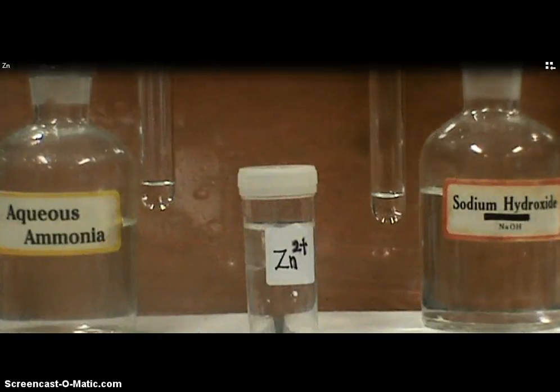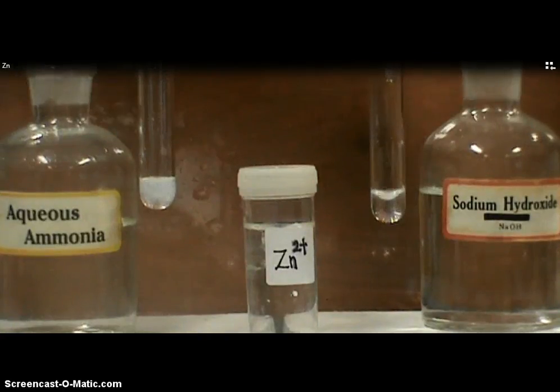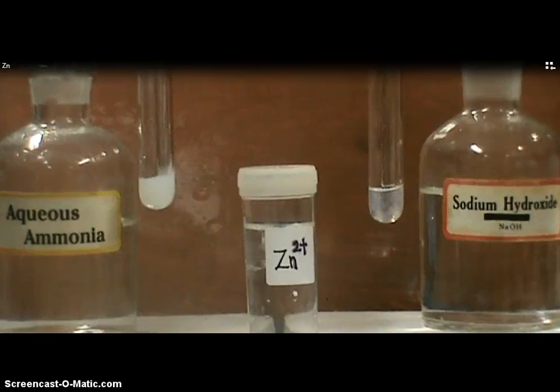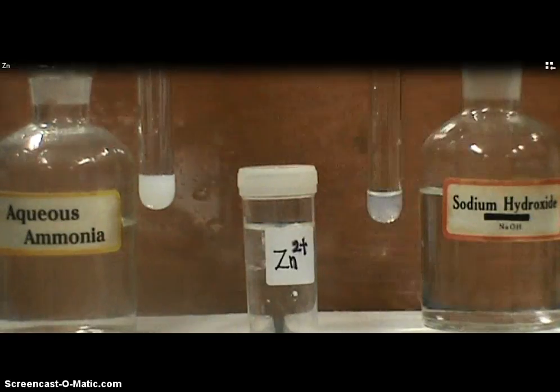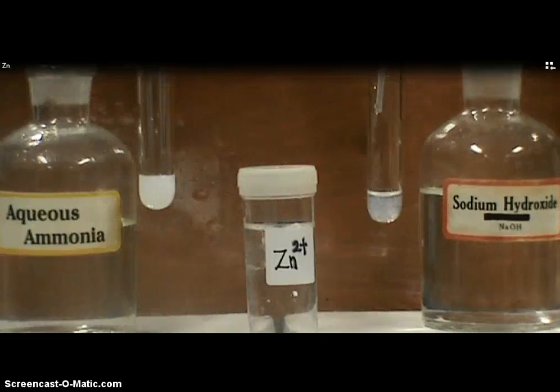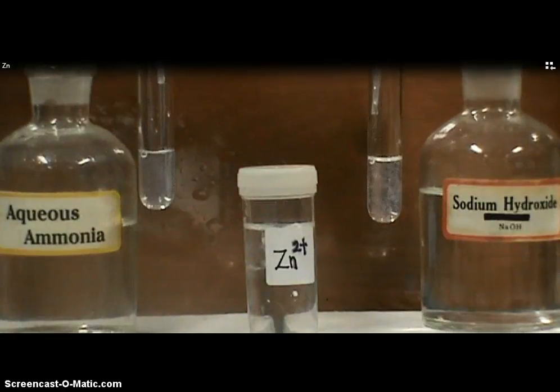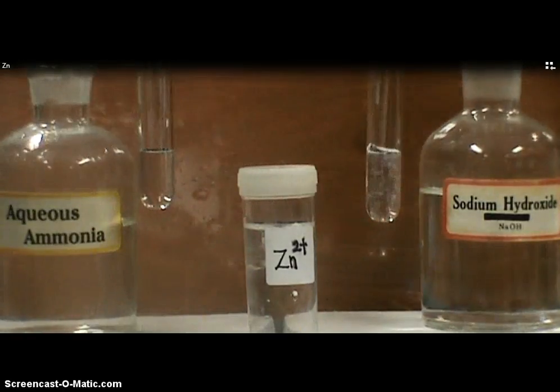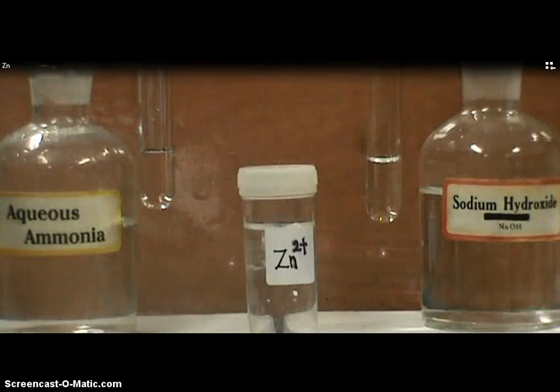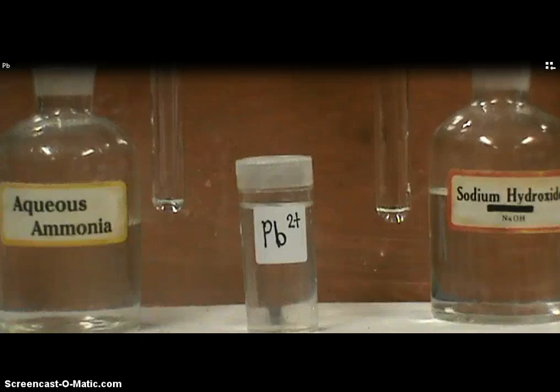A few drops of aqueous ammonia and aqueous sodium hydroxide are added to the sample of zinc solution. The contents are stirred for even mixing. We notice that a white precipitate is formed in both test tubes. Upon addition of an excess of each alkali, you notice that the white precipitate dissolves in both alkalis to form a colorless solution.